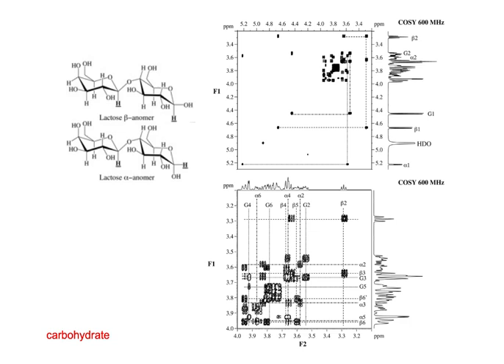Those are kind of blurry. I think you can start, say, with an anomeric position, and you can go into this mix in here, and I'm not going to necessarily walk us through it. So which one was here? Let me look back. 1, for example. This is alpha 1. Oh, it says over here.